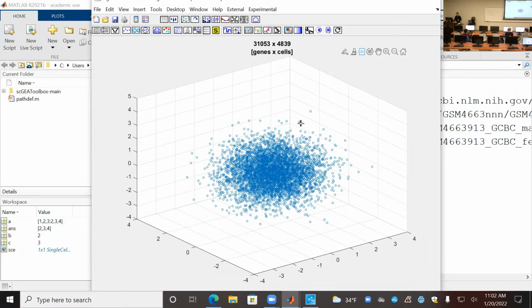One question for you: on my screen, I can see there's one cell here, another cell here. Do you see exactly the same location? Though this is a random number, because we use the same random number generation algorithm, we're supposed to have generated exactly the same numbers. So a random number is not truly random, it's a pseudo-random number. Otherwise, we shouldn't see the same location of the cells right here.